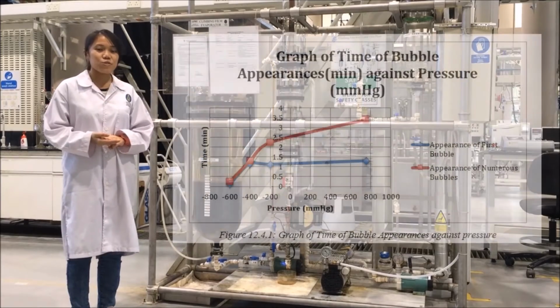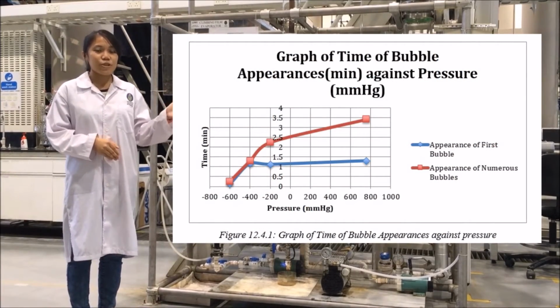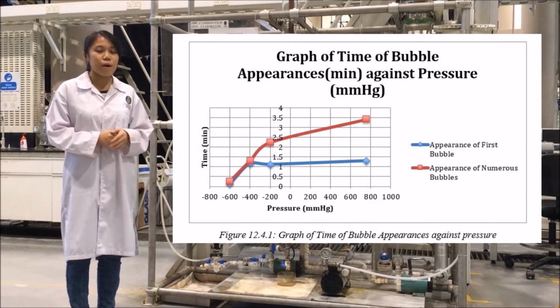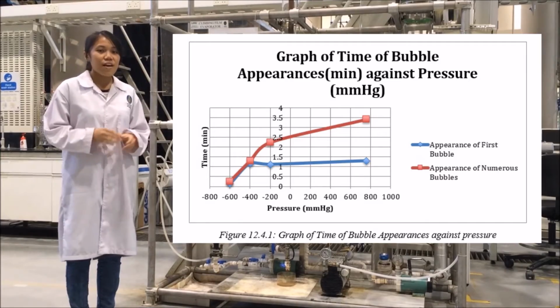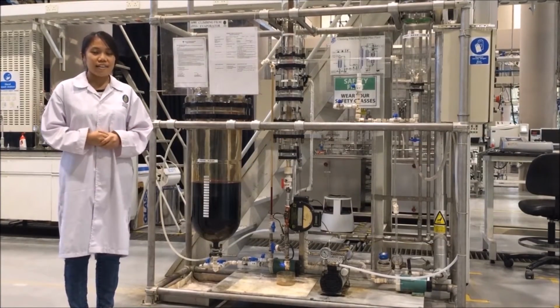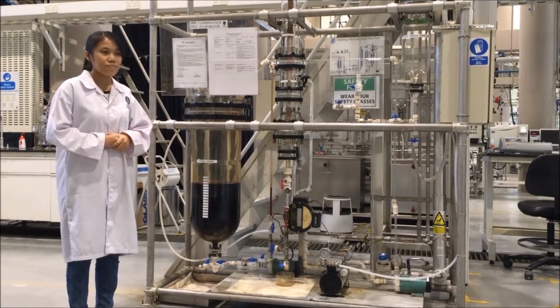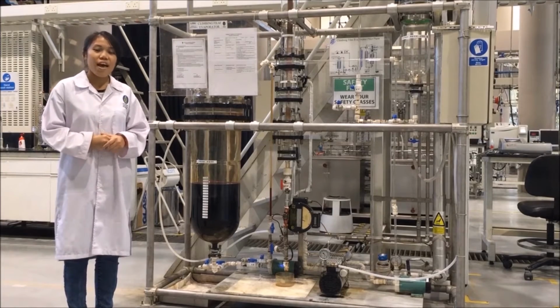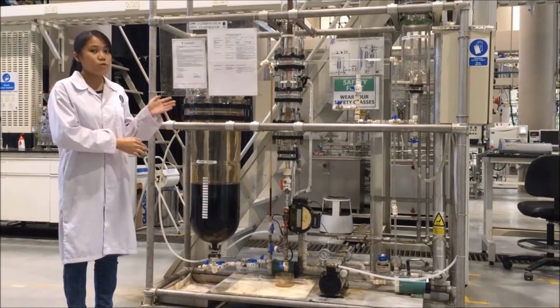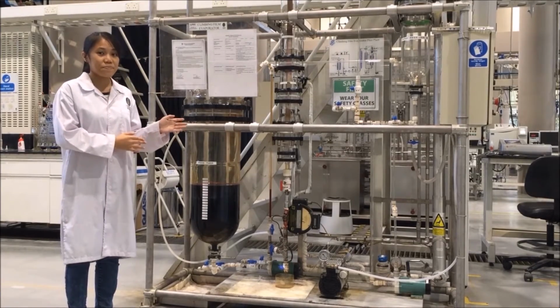As you can see in the graph on my left hand side, as the pressure decreases, the time of appearance of first bubbles and multiple bubbles also decreases. This is because the vapor pressure in the system decreases, causing the boiling point in the system to decrease as well. Thus, we can conclude that as the pressure decreases, the boiling point decreases, causing a higher evaporation rate of the system.